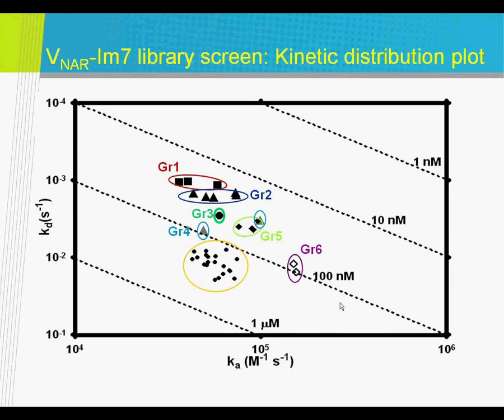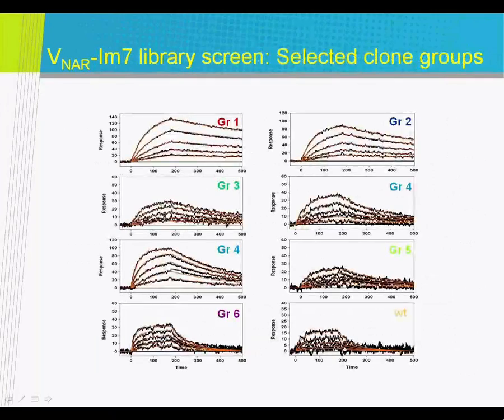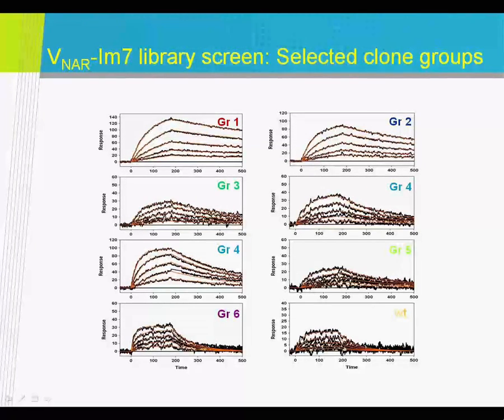Now, importantly, this capture system generates a stable baseline that allows for accurate kinetic binding analysis of antibody fragments. So we were able to pick up twofold differences, and we were very confident in those, and that twofold difference we were able to associate with a mutation. The other important aspect is that the DNase-E7 surface, the protein sitting on the chip surface, is so robust that it allows you to do repeated analysis.